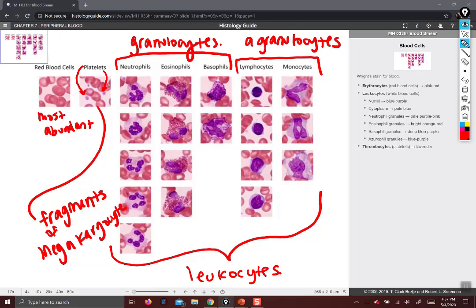Eosinophils have very obvious rosy granules and a bilobed nucleus. Those are all eosinophils.